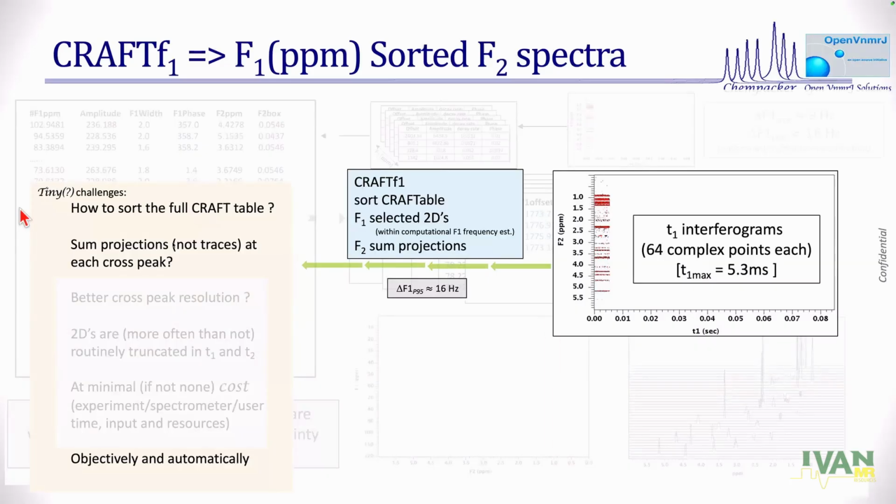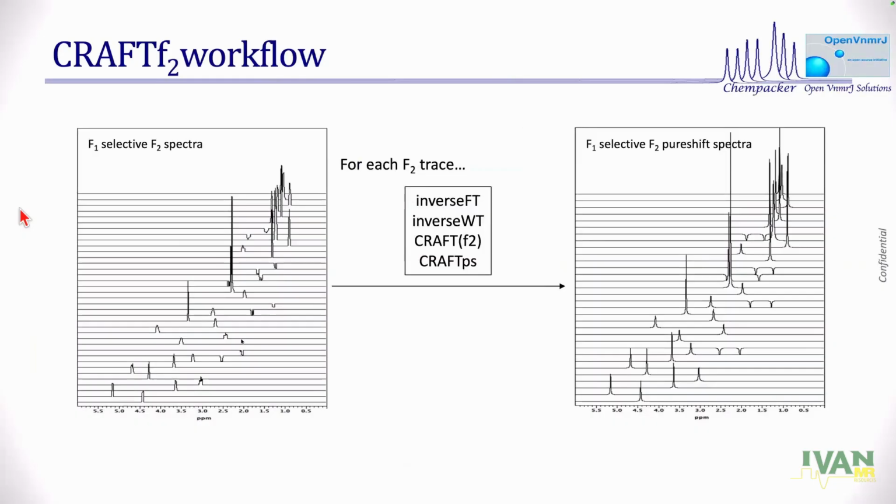What do I do with that is the question. That's the easiest downhill. So I have a spectrum. Somebody long time back told me FT and inverse FT are equivalent, so you are reversible. So I said, okay, I will take the spectrum and do an inverse FT, generate a FID for each one of them. Except don't forget that originally we started off with an apodized F2 dimension.